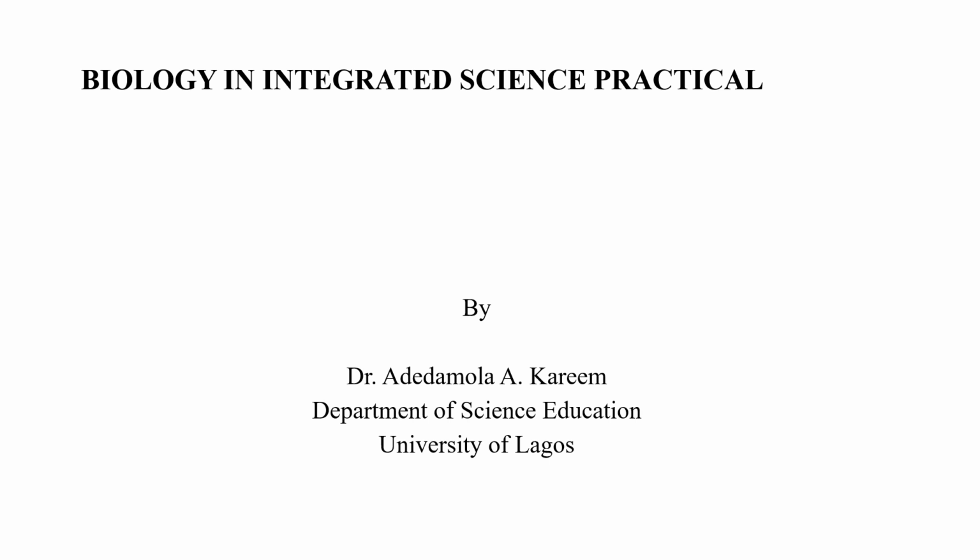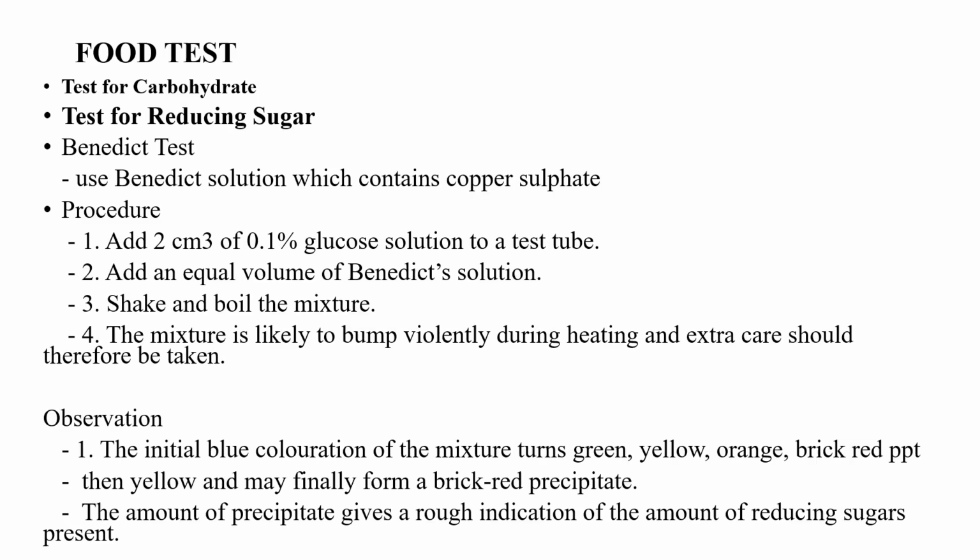Good day, everyone. In today's practical, we shall be looking at the different ways by which we can carry out a food test. That is how we can test for some classes of foods. So we're going to look at test for carbohydrates. We're going to look at a test for protein and test for fats and oil.